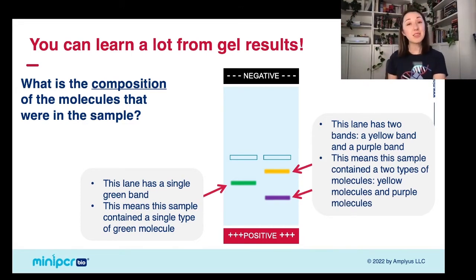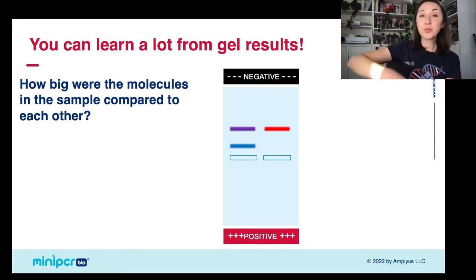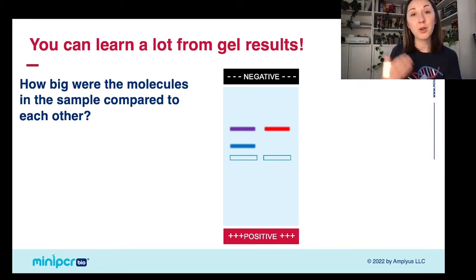Now, the final thing that we're going to be able to look at from our gel results is the comparative size of the molecules. Now, one of the things that I will note here is that, again, these molecules are being pulled in one direction or the other based on their charge. If they have a different magnitude of charge, that can impact how much they're pulled towards each side. But for today, we're going to assume that all of these molecules have the same net charge. So the only thing that is changing how far they run through the gel is just their size.